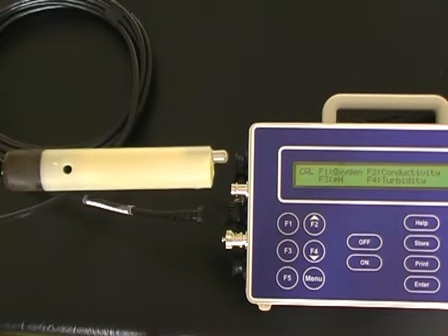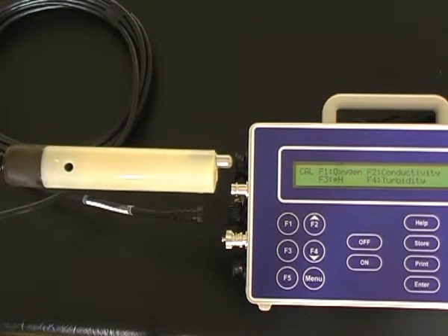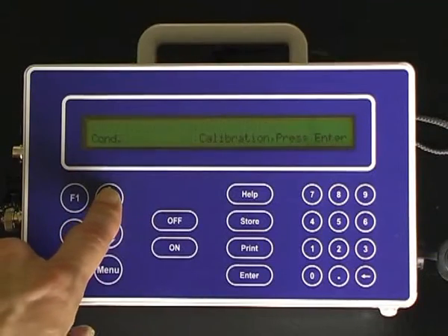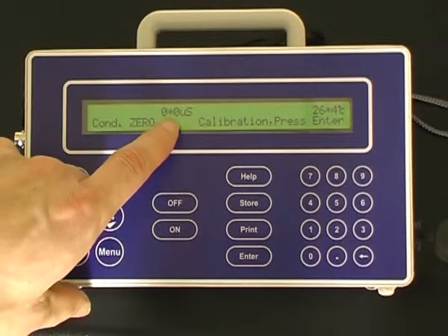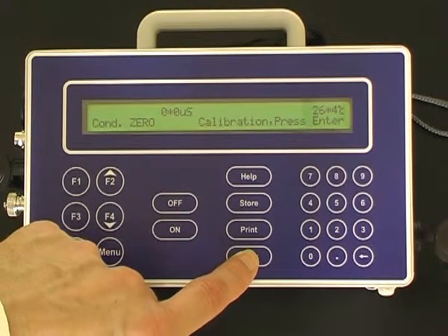The first point calibration of the conductivity sensor is a dry sensor in air, which should measure zero. Press F2 for conductivity. Once the sensor has equilibrated to zero, press the Enter button to calibrate the first conductivity calibration point.